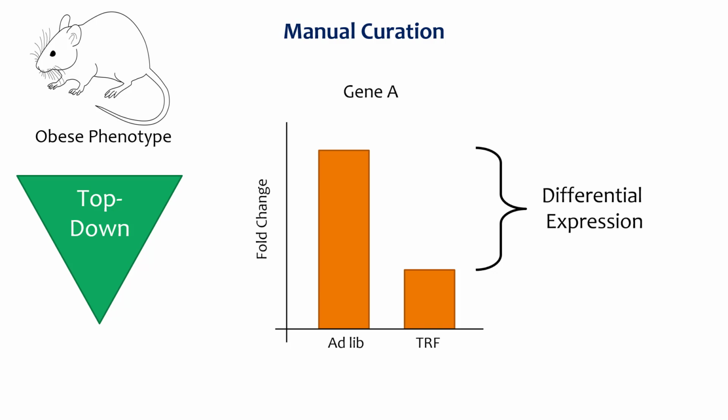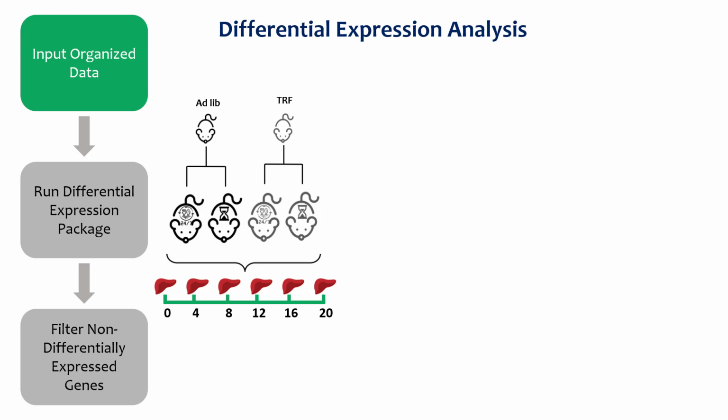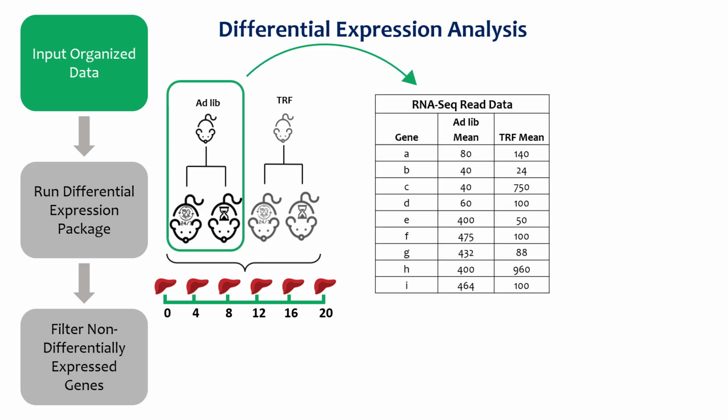The general workflow researchers use to determine the complete set of genes that are differentially expressed between two samples is as follows. First, the counted and normalized data from the RNA sequencing for the samples to be compared are entered using software specifically designed to compute differential expression, such as DESeq2. Next, DESeq2 makes pairwise comparisons between the samples and indicates changes in the expression of individual genes.